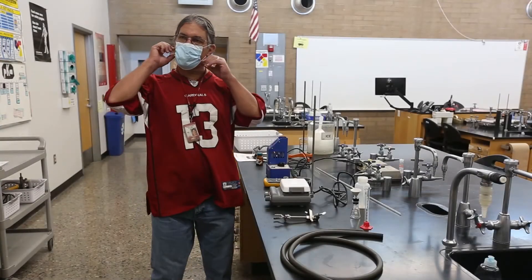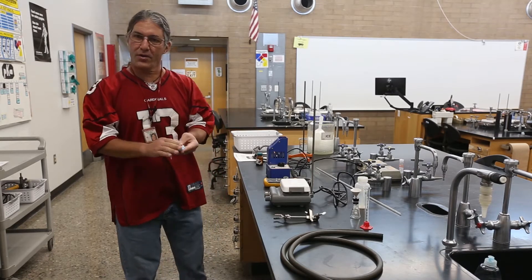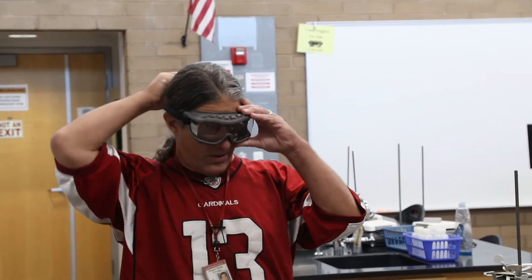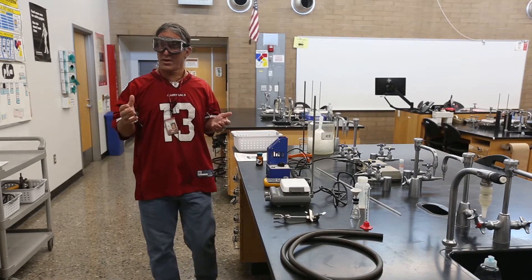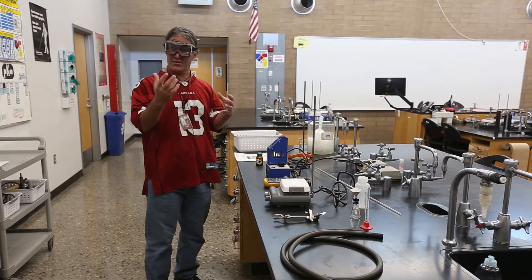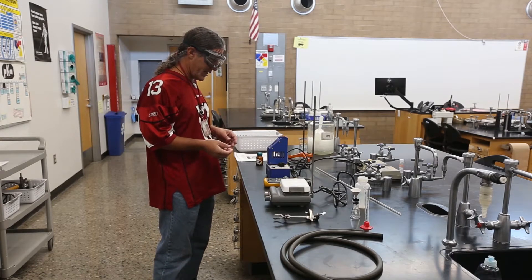We're ready to start another organic lab. In 2020 with COVID-19 I'll take off my face mask and replace it with safety goggles, because when we're heating something and dealing with glassware the last thing we want is to damage our eyes. I've looked at the safety data sheets for these compounds and nothing's dangerous enough to require gloves or anything like that.